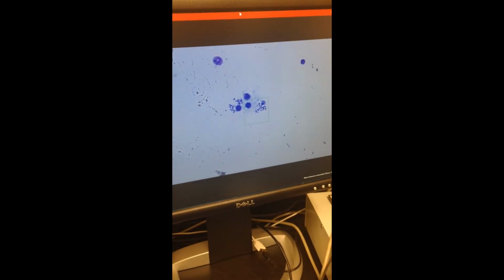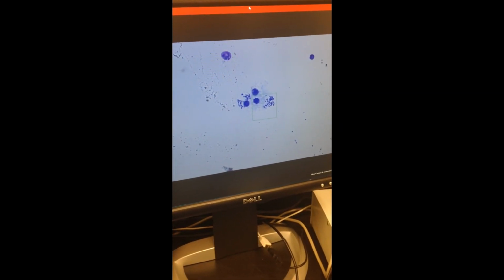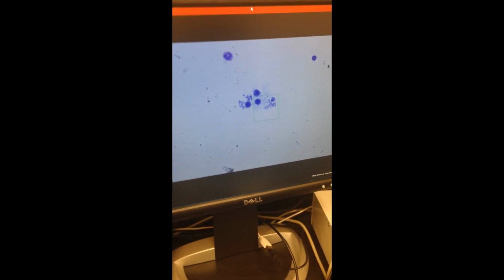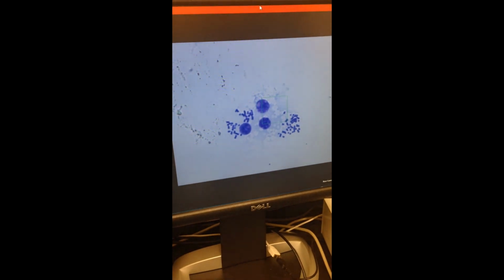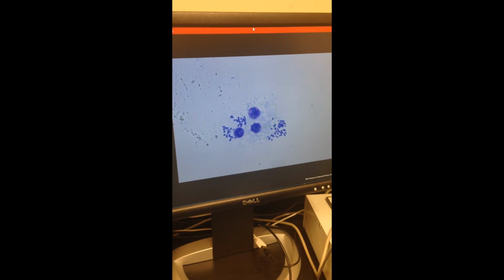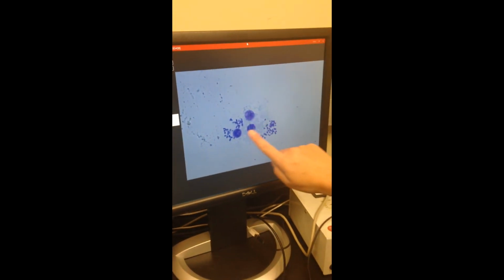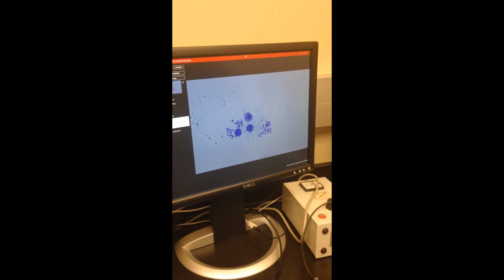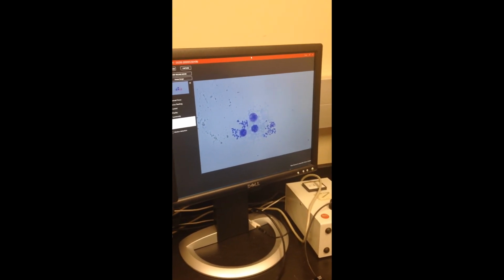So we're going to go up another power. And remember, when you go up a power, you're going to need fine adjust only. Okay, so we'll just sharpen that up just a little bit. And we're going to go up one more power to 400, which is what your directions tell you to view your image at. And use your fine adjustment only. And here you have 3 cells that weren't burst open, and you can see the chromosomes that have come out of some of the other cells that have been burst.